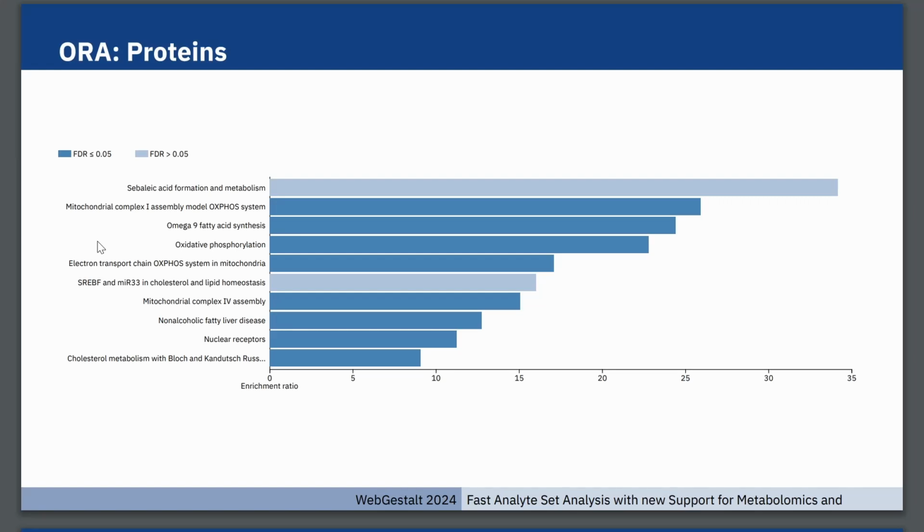In fact, it's like 0.00, like e to the -16 enriched, which is really high. But if you click on this bar on the website, you can actually see what proteins participate in it. You're almost 100%, like 99.999% sure that this is enriched more than what you would expect from random. Does that answer your question?